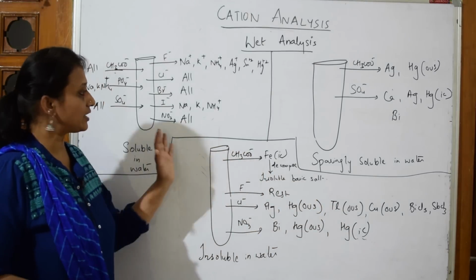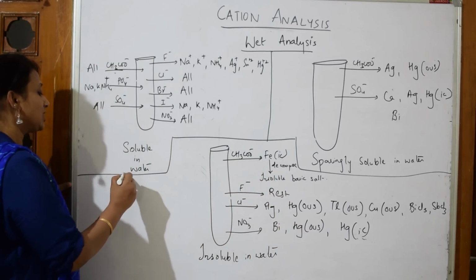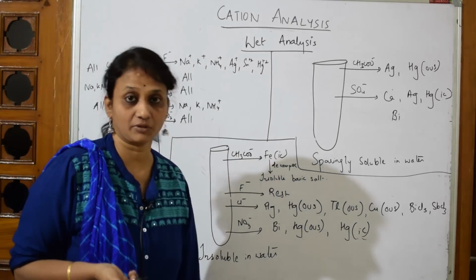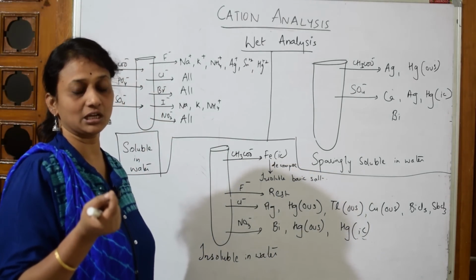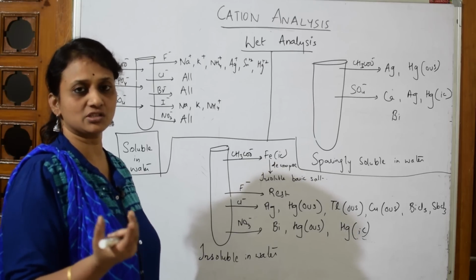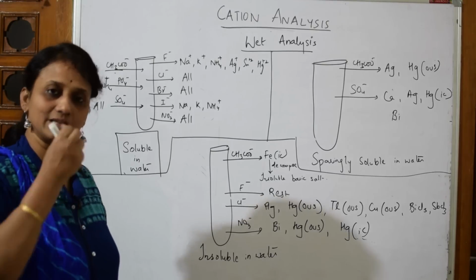So basically I have divided into 3 different test tubes here. Now the first test tube is where we are going to learn about the salts which are soluble in water. Right, so as soon as you add water, it will be soluble in cold water, or with a little warming, if you warm the test tube lightly, it will dissolve, or you'll get a clear solution.